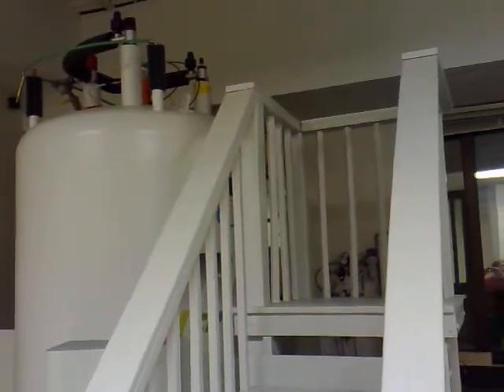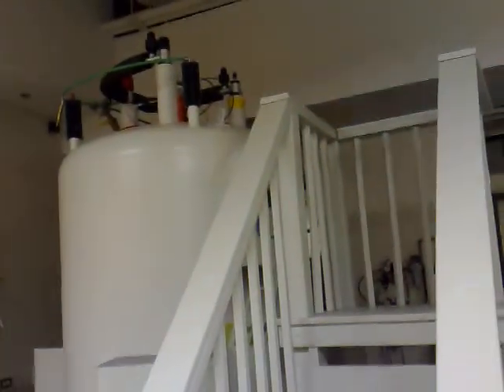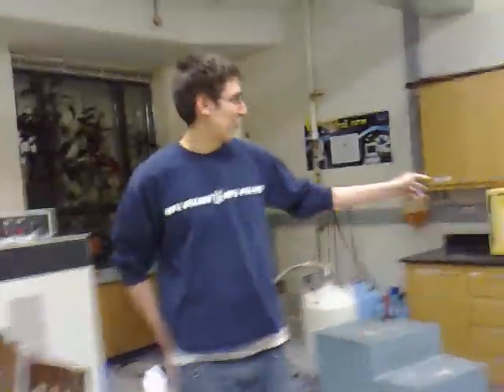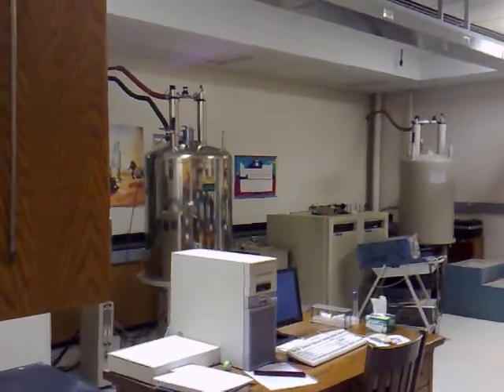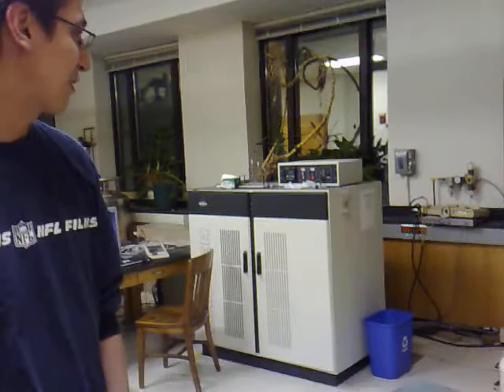You probably can't take the camera up the stairs near the magnet because it is a giant magnet — definitely not. In that room there are two smaller magnets that do about the same thing. You can go up, just not with your camera or anything metal. If you have keys in your pocket you can feel them pull a little bit. The facility manager mentioned these machines generate about 10 Tesla.